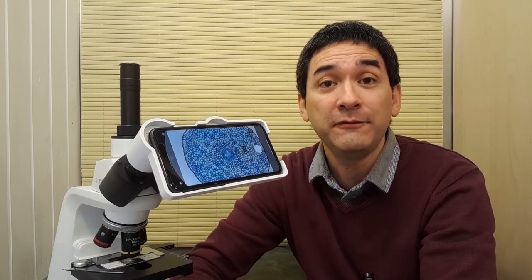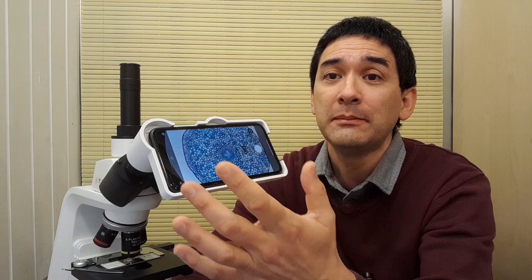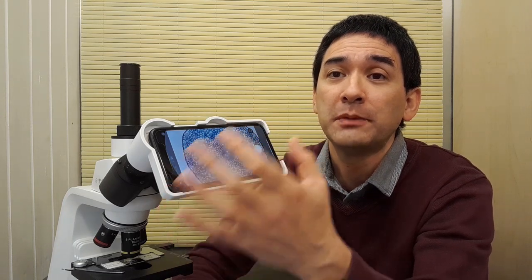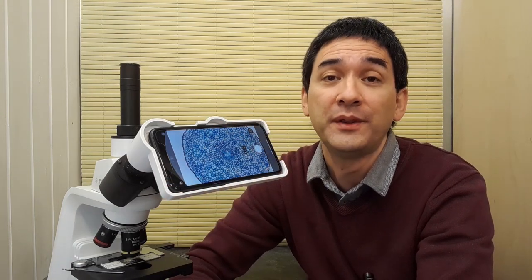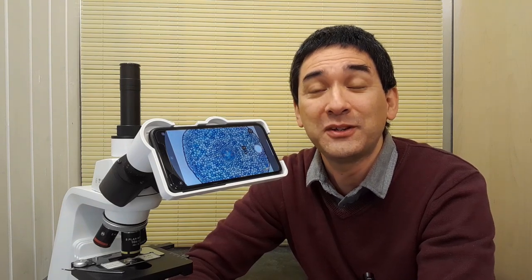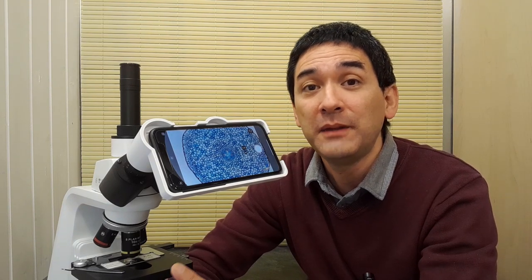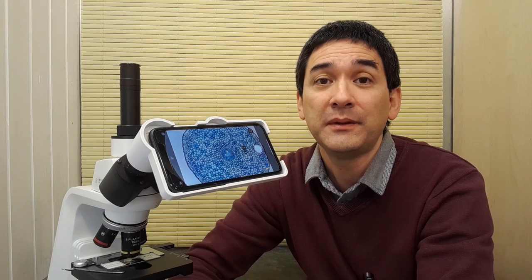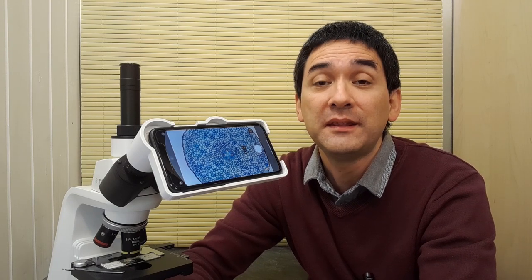And the iPhone does have a very good image quality and video quality so you are able not only to take pictures but you can also take 4K video with the iPhone 11.